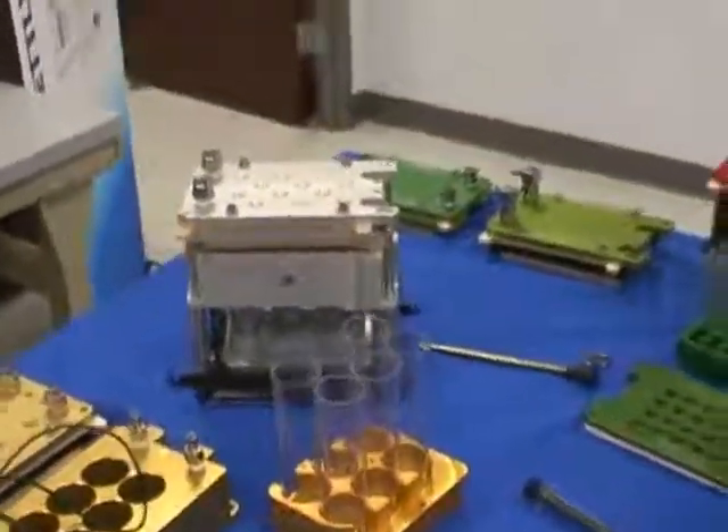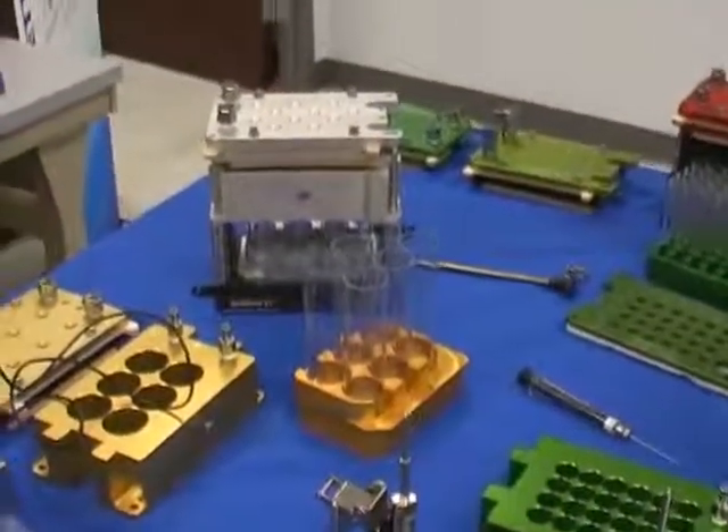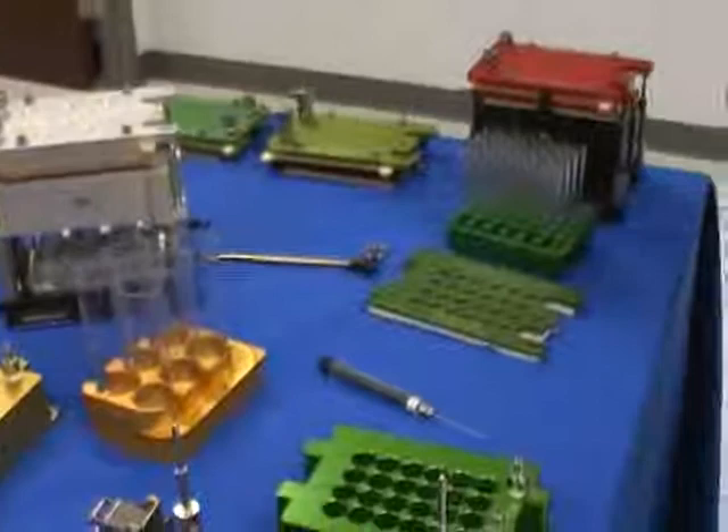So if I just had some test tubes lying around in the lab, that wouldn't work in this case — the variability would be too great. I wouldn't get the seal and I wouldn't have the isolation.